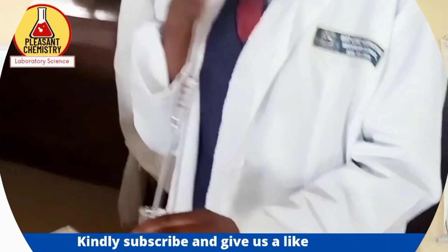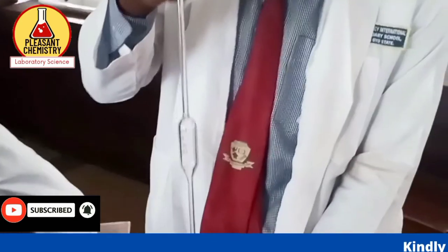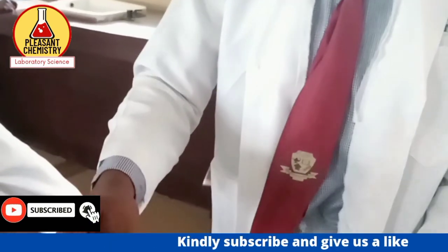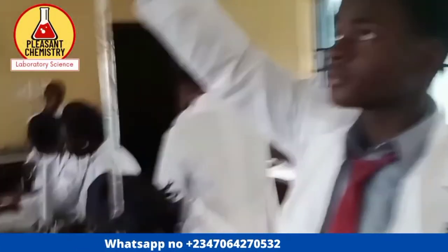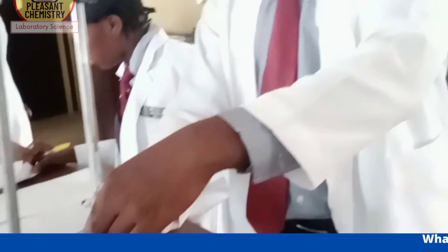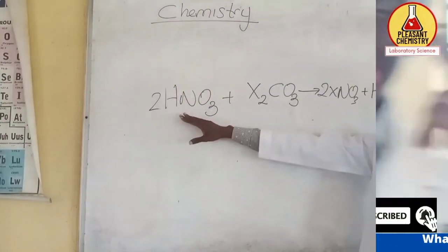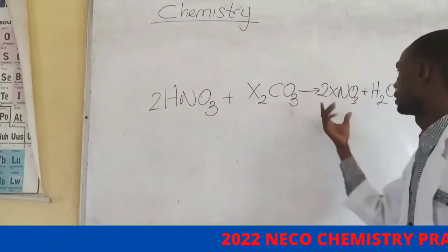The base, which is sodium carbonate, Na2CO3, is dropped into the conical flask. Then we add 2 drops of methyl orange. On adding 2 drops of methyl orange, the colorless base turns to yellow. Then we put our acid, HNO3, into the burette. Then we titrate. At the end point, the yellow color of the base changed to pink, which means that neutralization has taken place. Our acid is HNO3. Our base is Na2CO3. Then we have our salts.